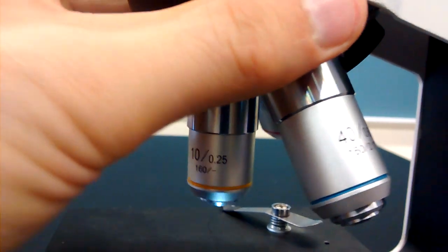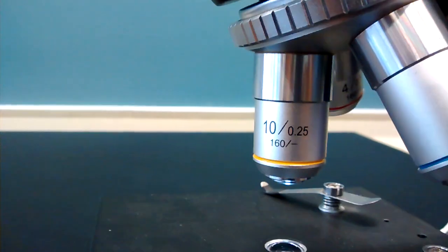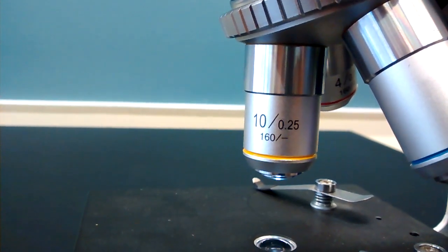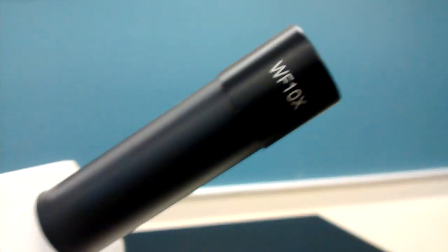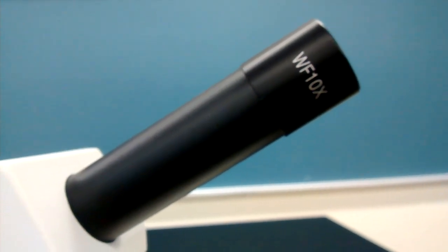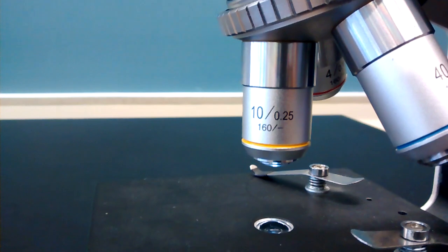The same is true of the low power lens. When using it, it will magnify ten times. Together with the ten times of the eyepiece lens, means that you're magnifying 100 times as large.